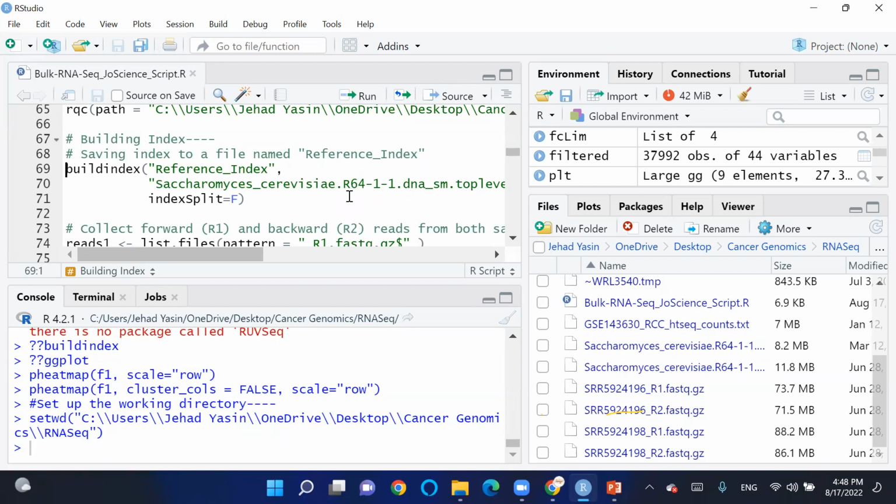It is much more efficient to use an indexed book to search for the word according to its alphabetical order, for example. It is the same for indexing the genome. We should create indexes for each sequence within our reference genome in order to align the reads, our fragments, efficiently. So we can build an index for the reference genome by using this function, buildindex.